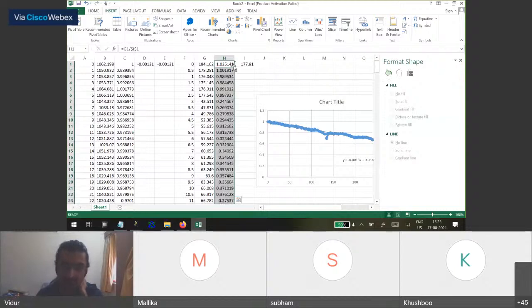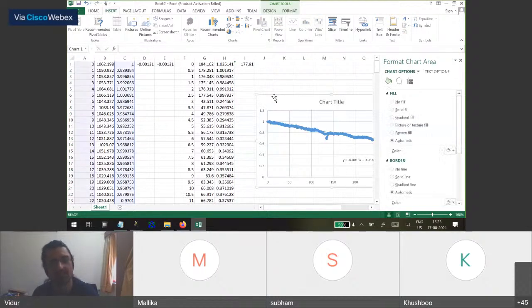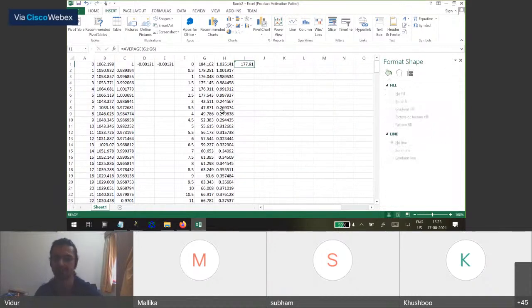And if you just double click the bottom right of that cell, that intensity will be carried forward till the end of the data set. Now, the final thing that we have to do is a very simple thing. We have to reorient this time scale, time series, so that 0 comes as the first post-bleach level.